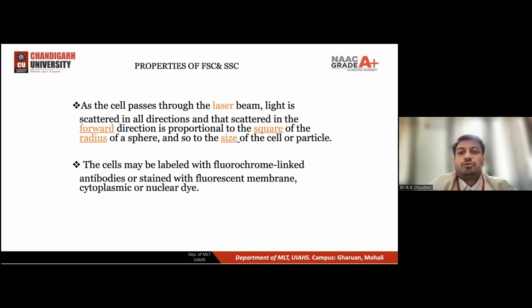Now, what is the one thing in flow cytometry? We are using color, fluorescence color. We will discuss many different ones later, because today is just the introductory class for flow cytometry. Later, I will show you the detail, because flow cytometry is not a one-day lecture. We have to take 2-3 lectures, but I will try to compile it.